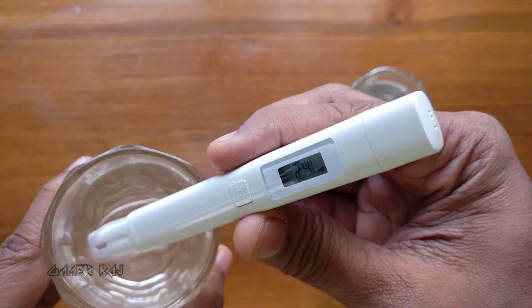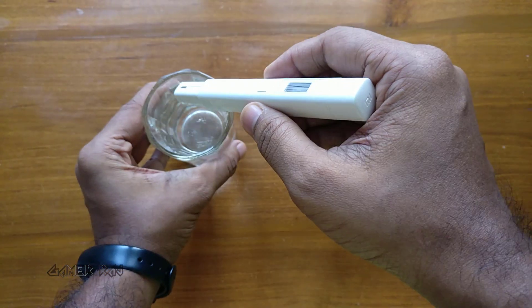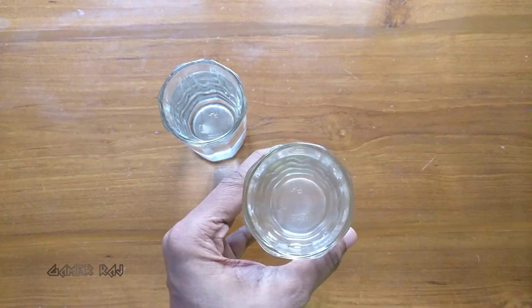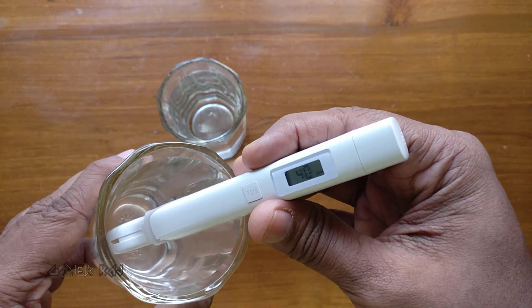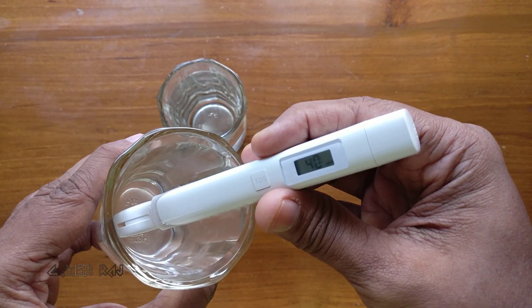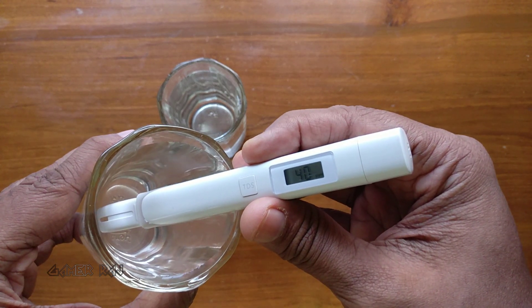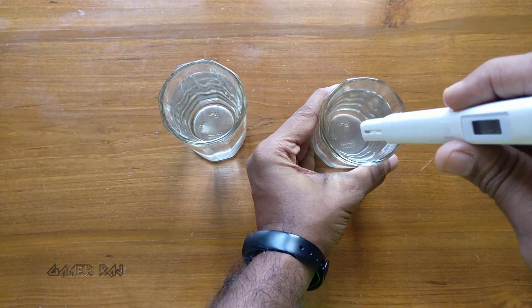Measuring the first sample shows 24 ppm — it has high purity. Let me shake off the water before testing the second sample. It is showing around 40 ppm, with all those particulates from the air. Still not that impure — good enough for drinking.